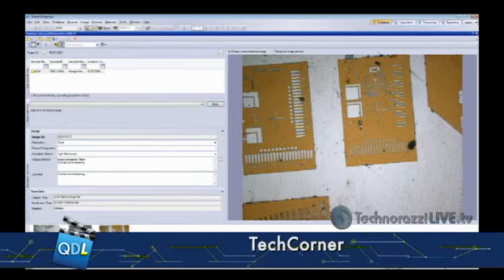So today the Stream 1.9 software, some of the quick things I'll cover, some of the new features. The software does incorporate a very integrated database tool, and there are several new features that I can't cover all of in the time we have, like copying fields and being able to paste them quickly into new inserts. The database allows archiving of your images and measurements and reports that are generated, and to be able to search through them quickly later and share throughout the network of users in the company, I would imagine.